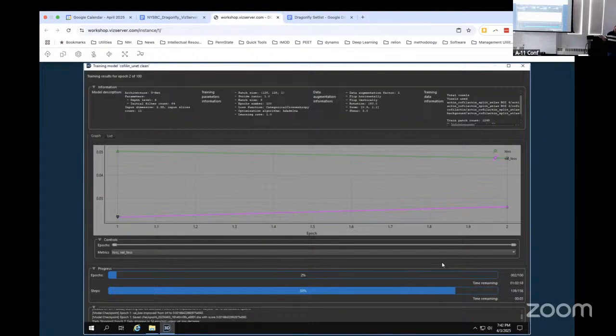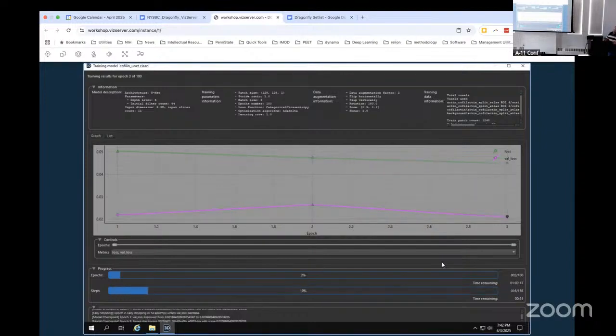Maybe we could come up with some way to easily contact each other, maybe email. Email me if you guys have any trouble. I'm going to share with you a finished tutorial that I've given to lots of people that I was trying to make better before this. I'm going to send you the old one just so that you have something that'll walk you through installing CTS, running it, generating synthetic data sets, and then getting them all into Dragonfly. This is step by step for all of that. And since you've done this, it'll probably be really easy to follow.